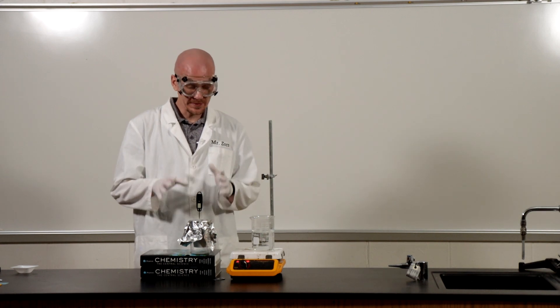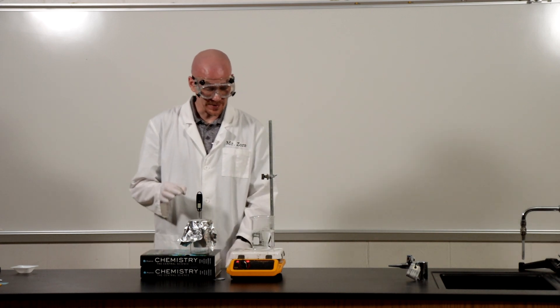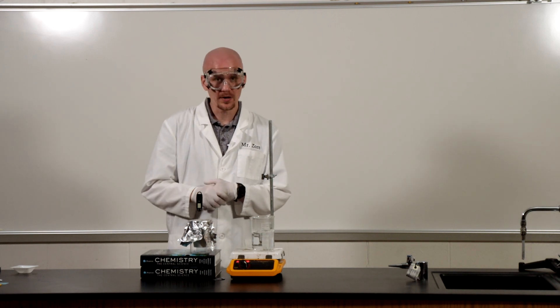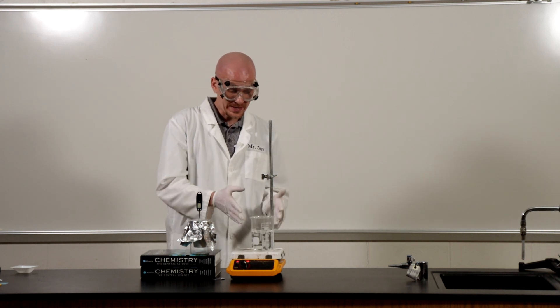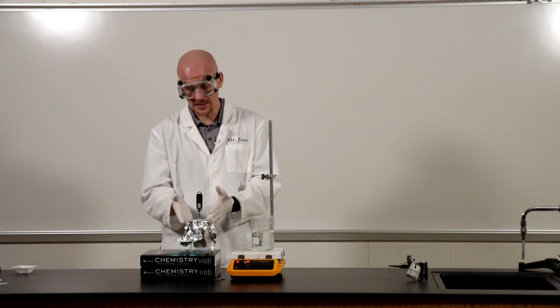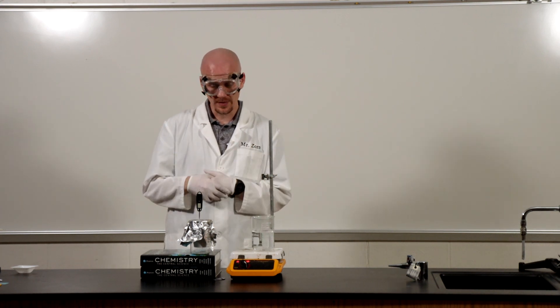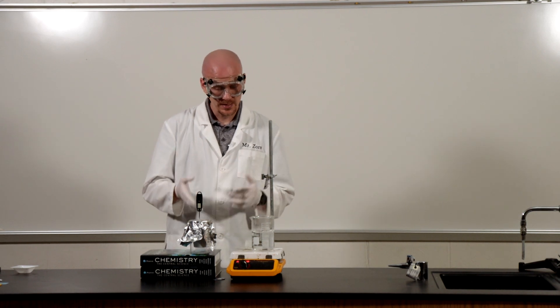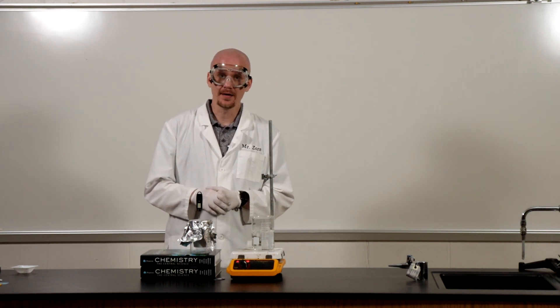So you should have all the information you need now to figure out the specific heat. We had a certain temperature of our water, our initial temperature of our water. We heated our metal. We put the metal into the calorimeter. It raised the temperature of that water. So using that change in temperature now you should be able to work backwards and find the specific heat capacity of our metal.